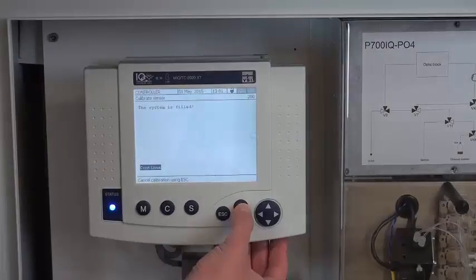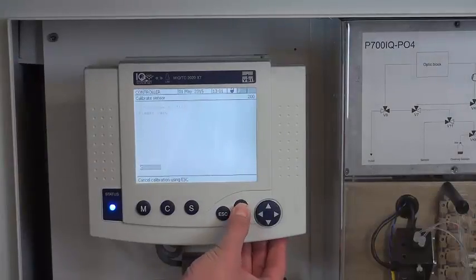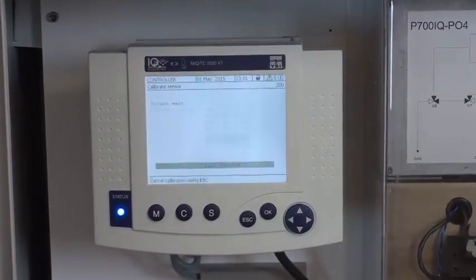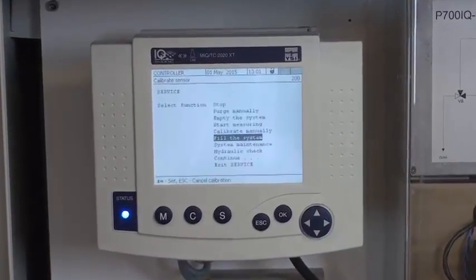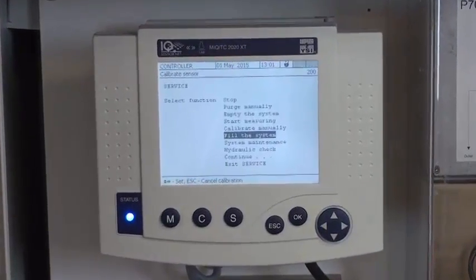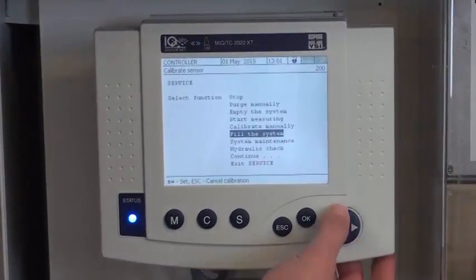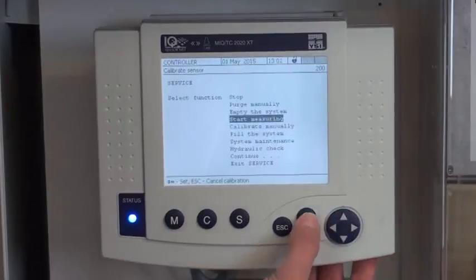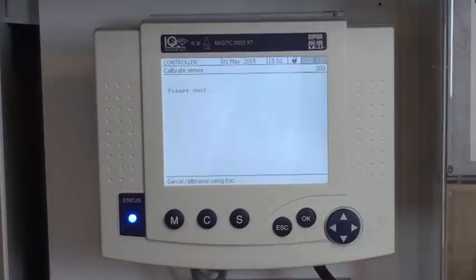Now that the system is filled, I press OK to continue. And it takes me back to the startup. Highlight start measuring. Press OK.